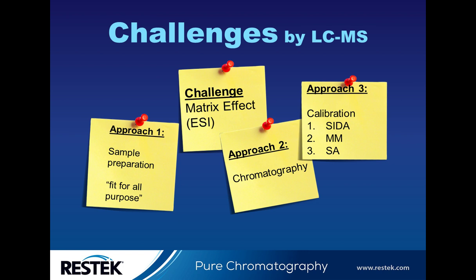I think it's more suitable for this type of analysis because compared to UV or fluorescence detectors, MS allows the analysis or identification without any derivatization. In addition, mass spec also offers better sensitivity, throughput, specificity, and efficiency.